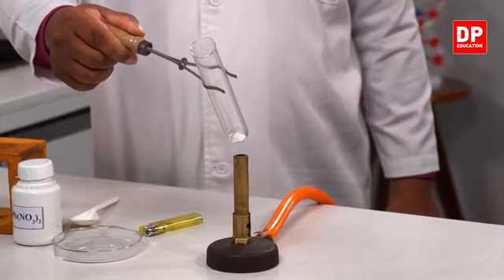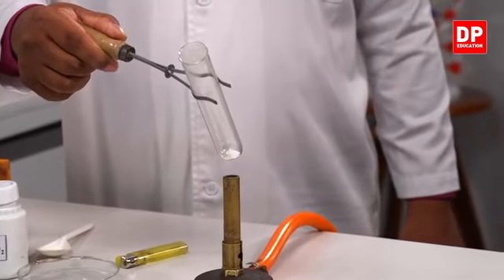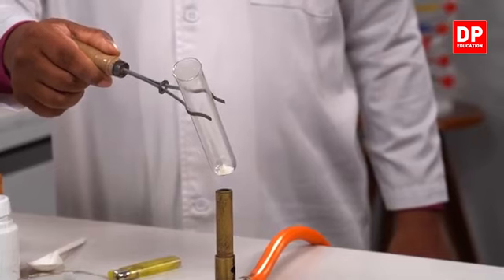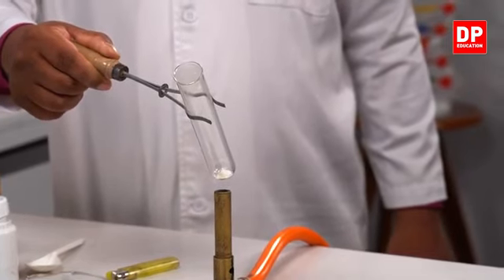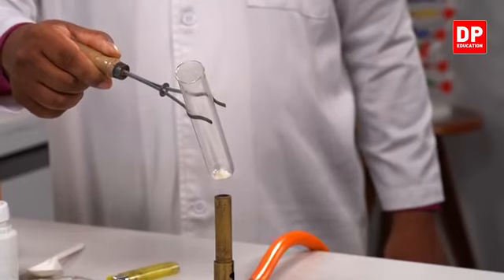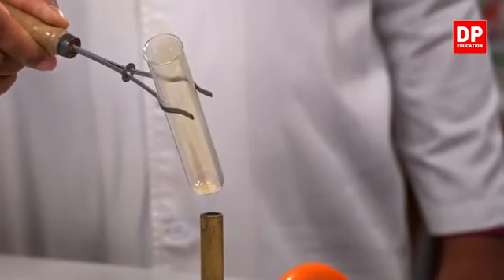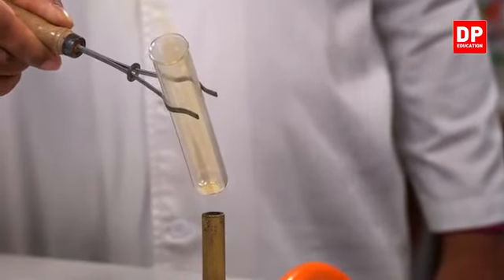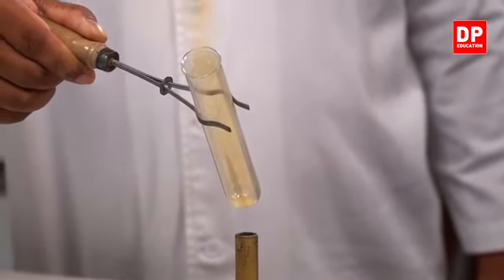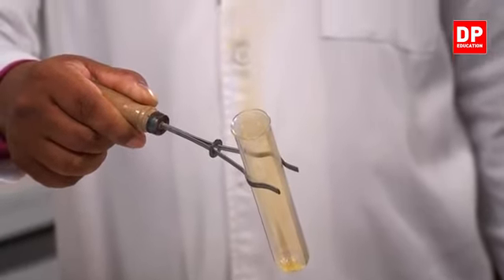See, in this situation, some small bits of explosions can also be observed within the boiling tube. So we have to be careful when doing this experiment. Observe the changes very well. See, a gas is going to be emitted, like a brownish color gas is going to be emitted.